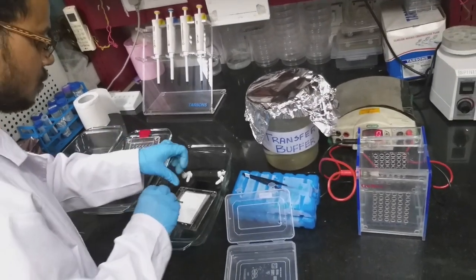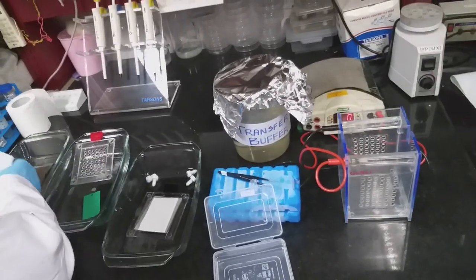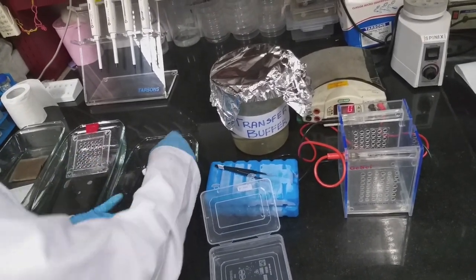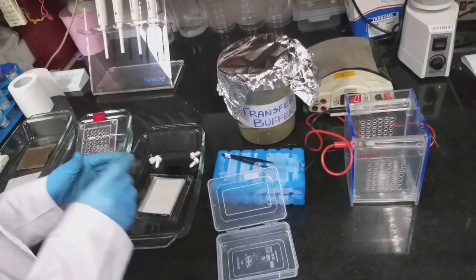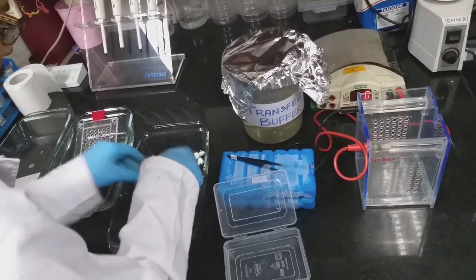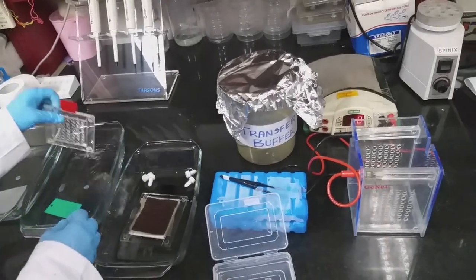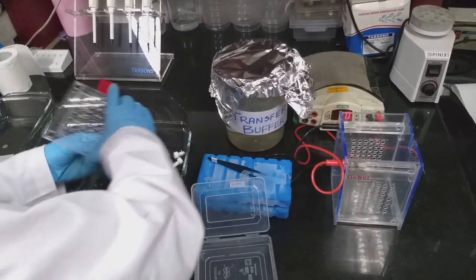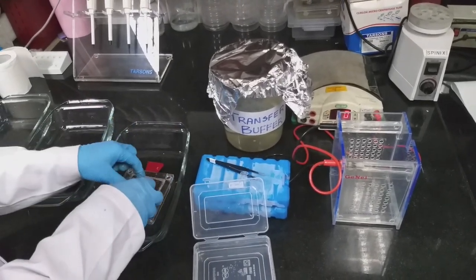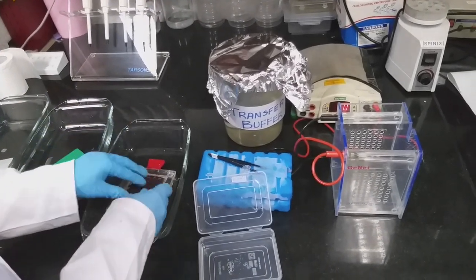Next, we have to remove any air bubbles if present. We have to overlay with another blotting sheet and remove the air bubbles. Each and every time when you introduce something, you have to remove air bubbles. So this is the final sheet. This is the positive side of the cassette. Just close it like this. These are the screws. We have to tighten them up, then only the contact between the gel and the membrane will be sufficient to get transferred.